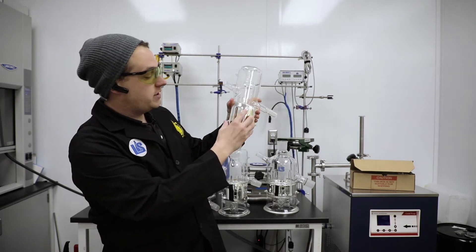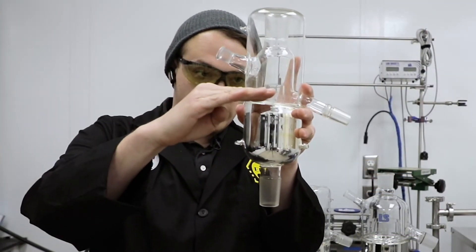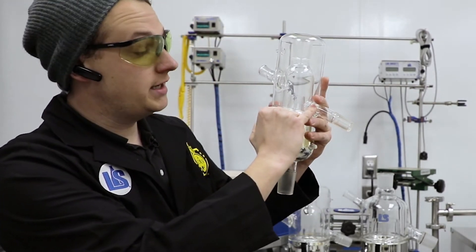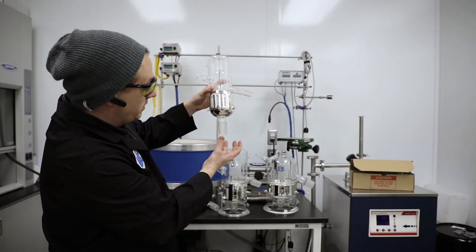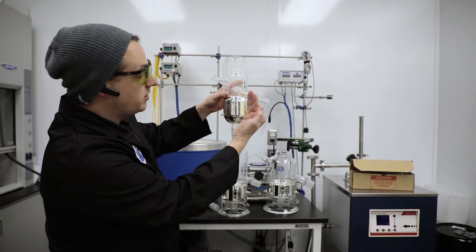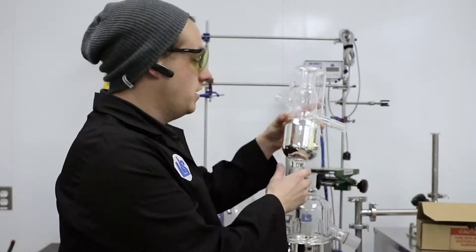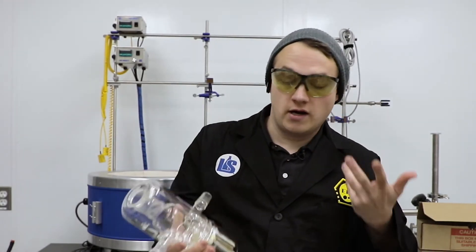You can see this one has the silvering on the bottom. The tube on the inside is shortened as much as possible, but still higher than the condensate outlet. The idea behind this one is that we're enlarging our tube to increase the amount of vapor that can come out, and thus the actual pre-condenser is bigger too. This head is available as well in a 45/50. They work great — they're anywhere from about 1.5 to 3 times the speed, depending on what temperature you're running at.